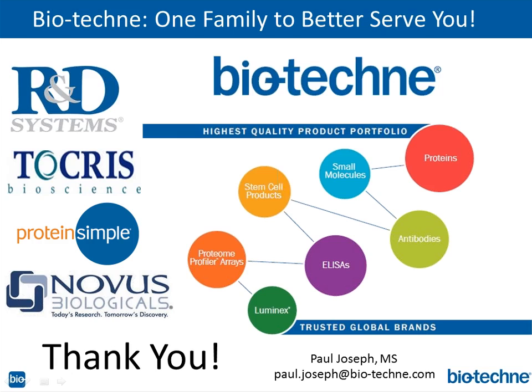I guess the question I have is about the detergents that you're using. When we provide a kit, especially the intracellular kits, it comes with a lysis buffer that has a lysis detergent formulation. I believe there's a detergent in there, and they haven't told me what it is, and that has to be a certain concentration and it probably is some kind of non-ionic detergent, so it's not too harsh and it's not going to interfere with the antibody-antigen interaction. But I would have to check with the lab. But theoretically, it should be possible. The question would be, what is your detergent?